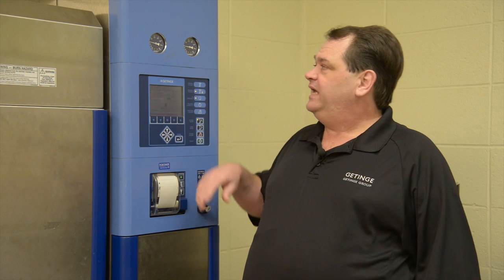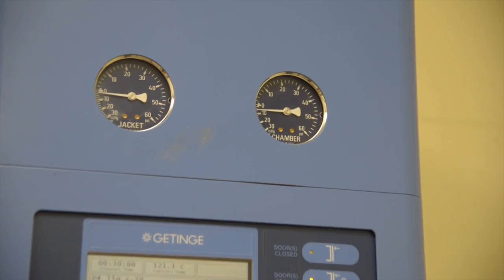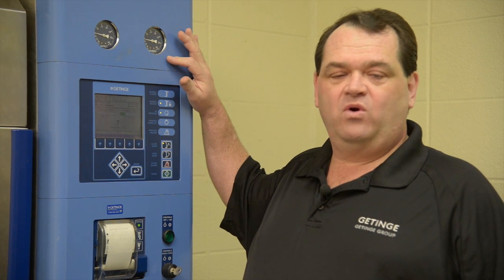First I want to start with the jacket pressure gauge. This gauge indicates the amount of pressure in the jacket. The jacket is the surrounding metal structure for the chamber. We preheat the jacket to keep the chamber at temperature and to help minimize the condensate forming in the chamber. Next we have the chamber pressure gauge. This indicates the amount of pressure or vacuum in the chamber at any given time. It's very important that we never open the door with two pounds or more pressure or two pounds or more of vacuum. Our machine will not allow this to happen — that is one safety feature of the machine.